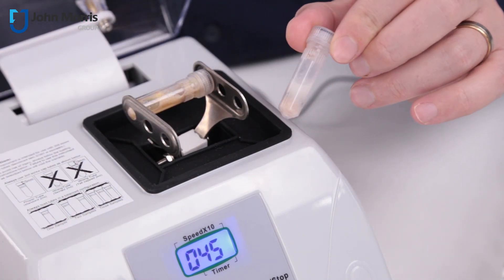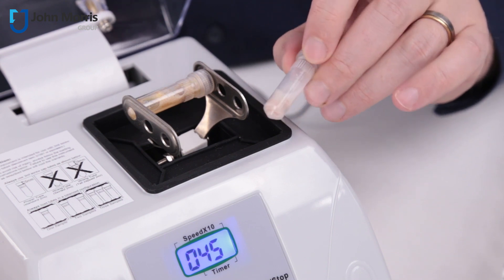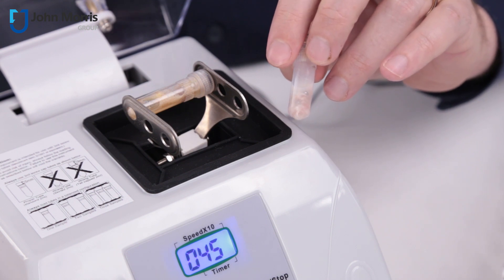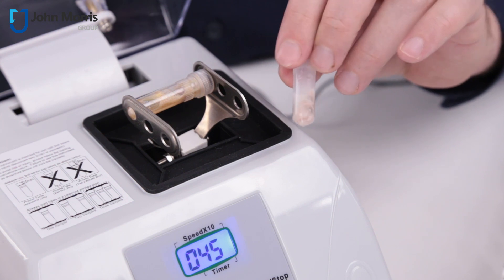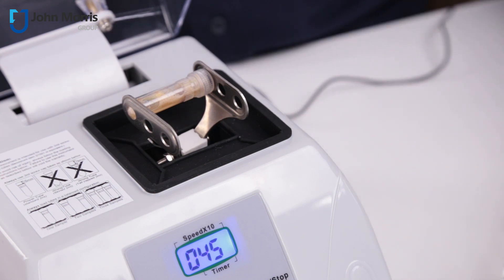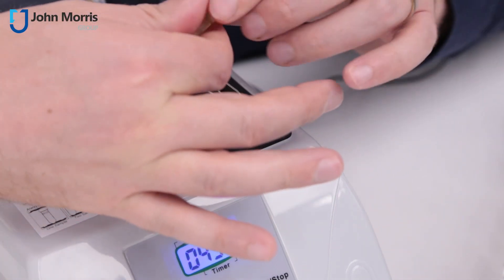That was a piece of salami. In 45 seconds we haven't achieved a complete homogenization. Probably what we need to do is run it for slightly longer than 45 seconds, or choose a different configuration of beads. But overall, not a bad job in 45 seconds — probably a slightly heavier bead would be more optimal.